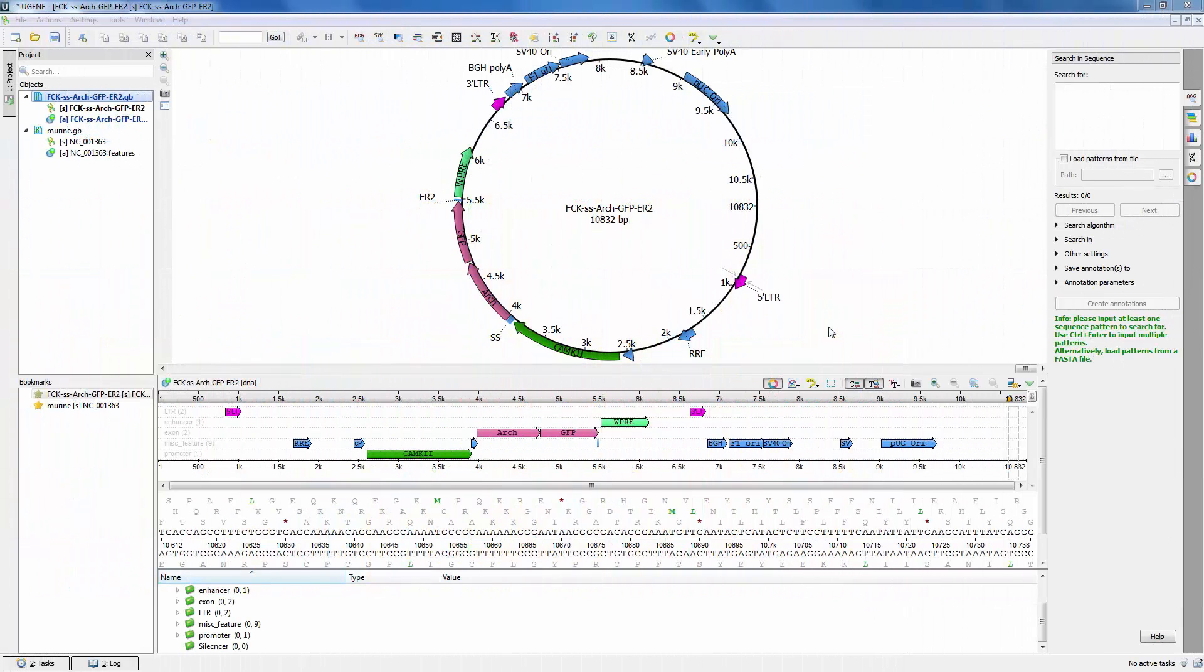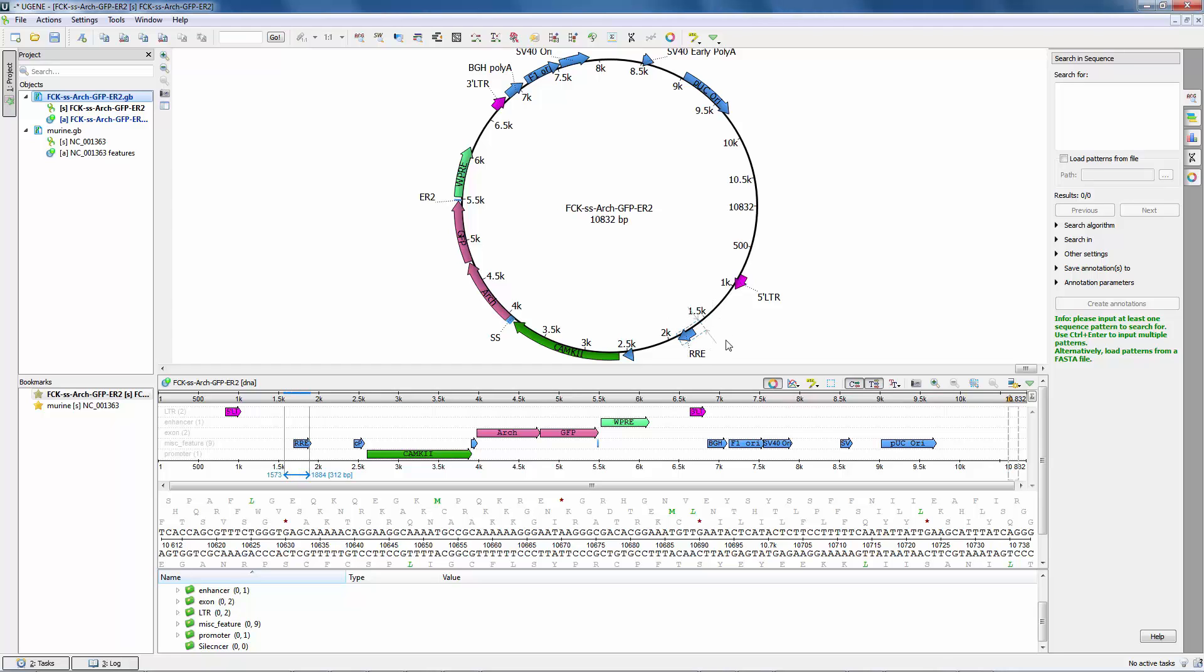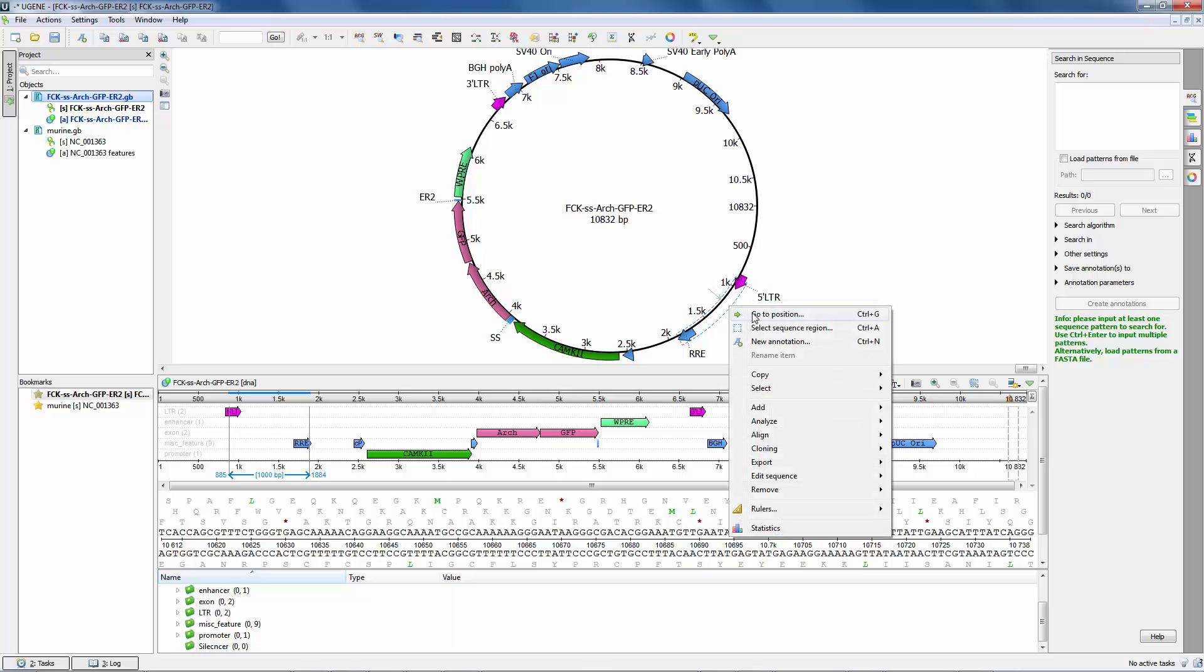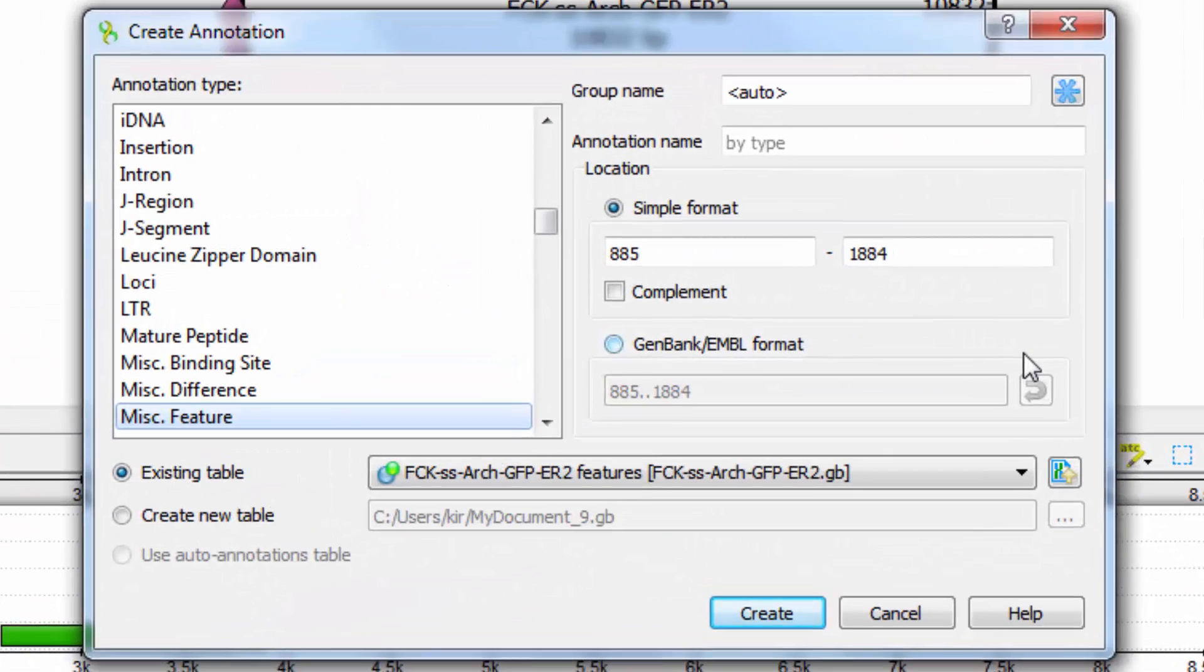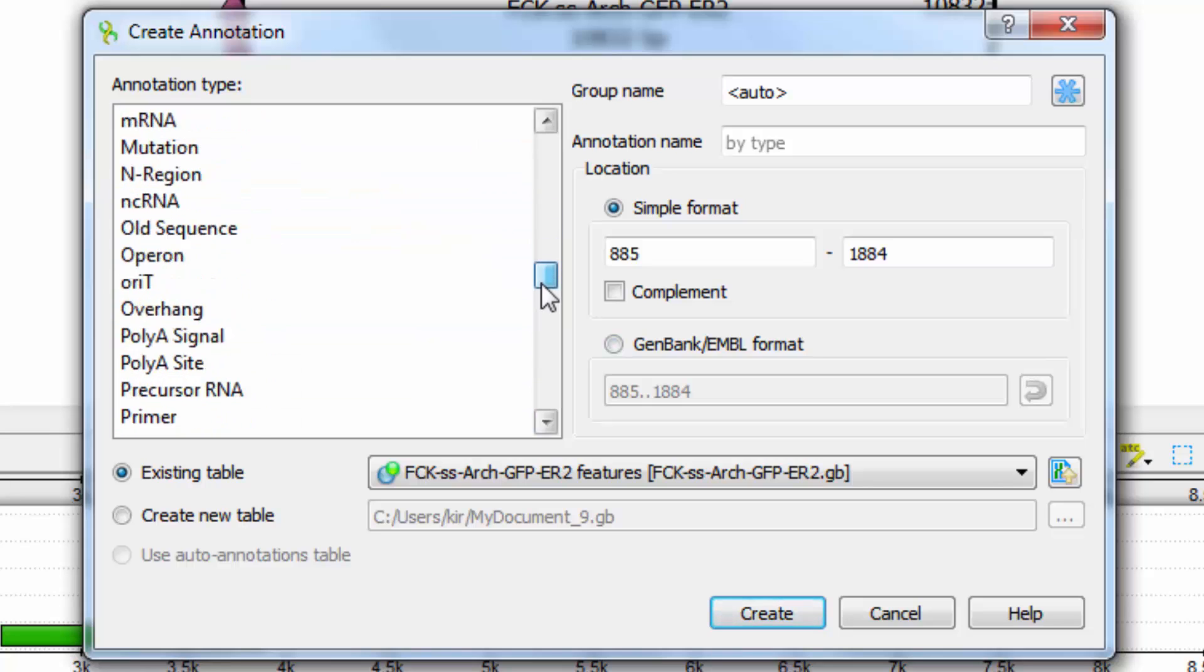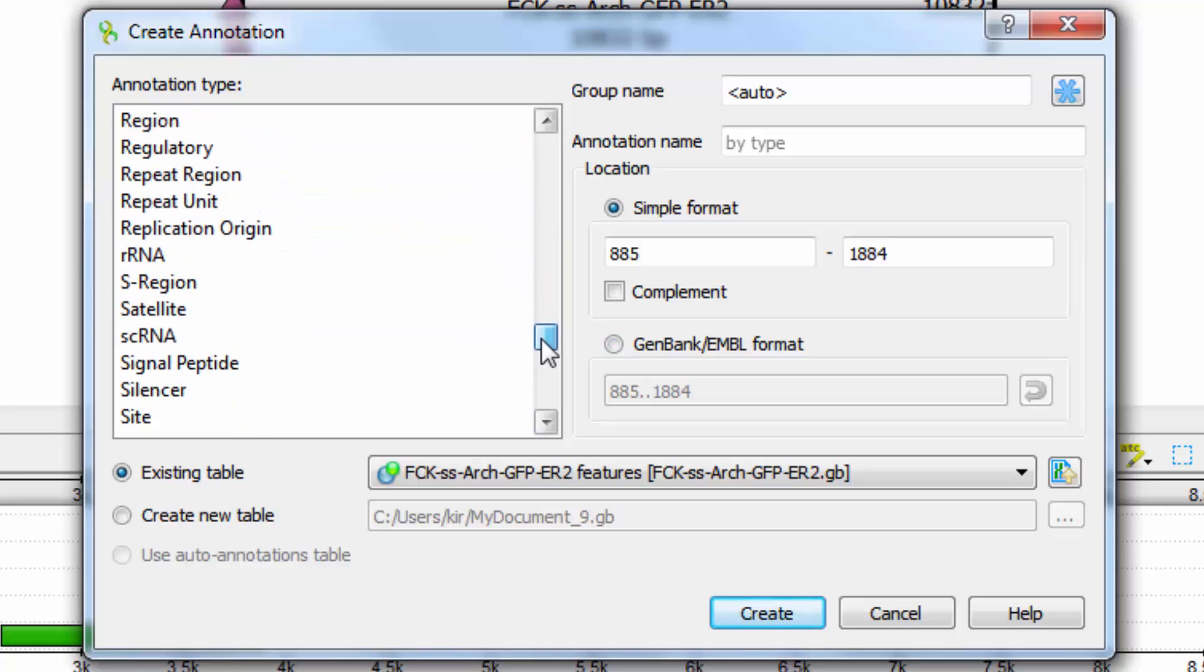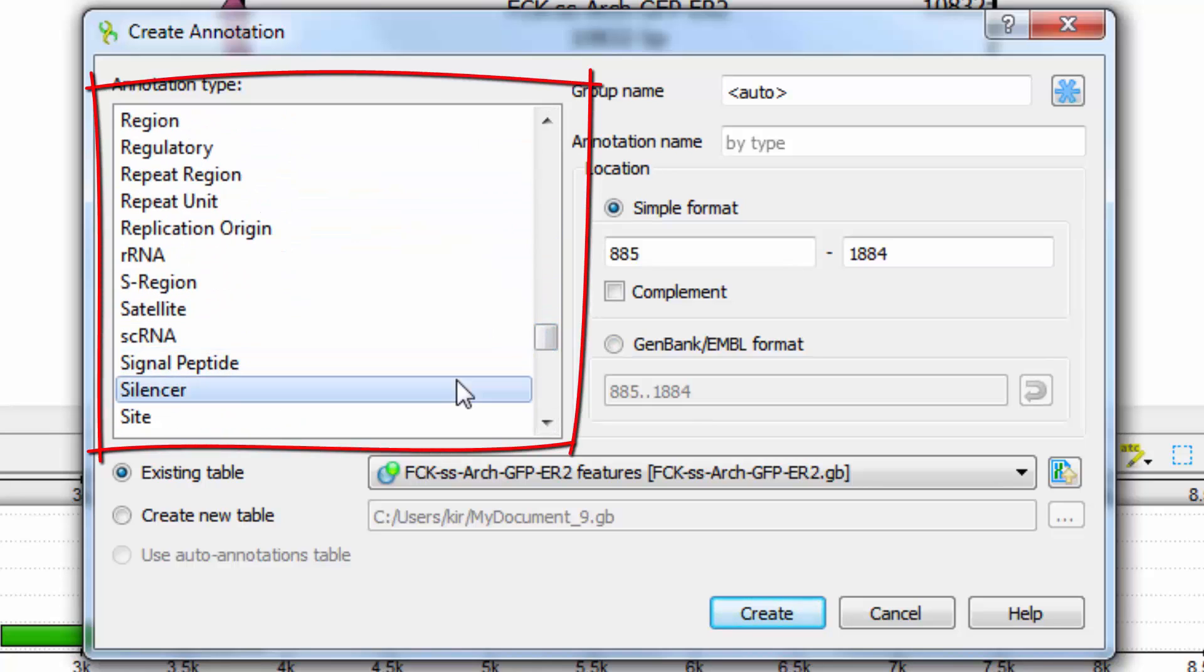Finally, there is a couple of modifications in Eugene for people who consider moving to Eugene from Vector NTI. The Vector NTI sequence format was fully supported in the current Eugene version. The format is similar to GenBank, but has an extended list of feature types.